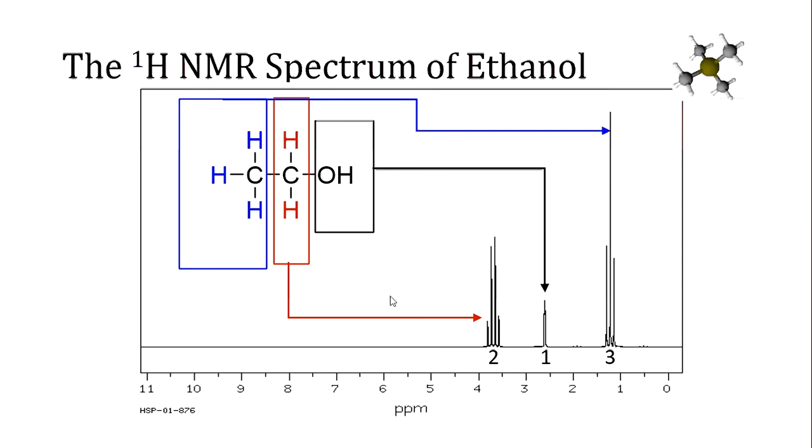The 3 hydrogen atoms in the methyl group shaded blue correspond to the peak with the lowest chemical shift. And so you can see that chemical shift is around 1.3 parts per million. And again, that oxygen atom, even though it's not directly attached to the methyl group, has dragged the chemical shift up just a little bit from the 0.9 that most methyl groups have.